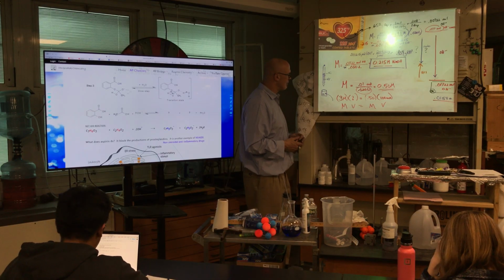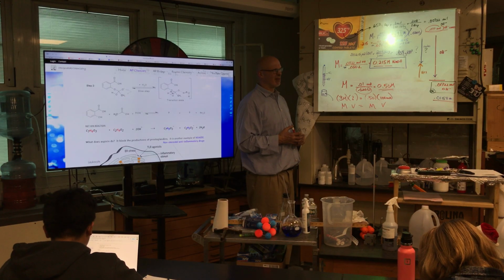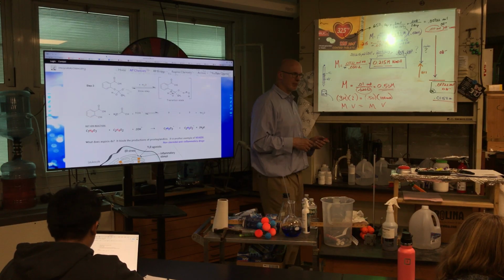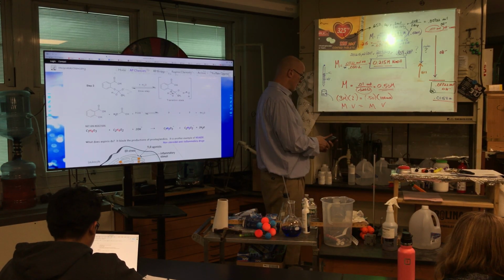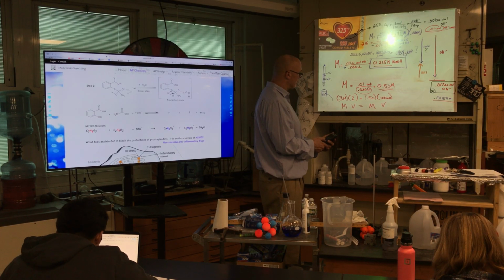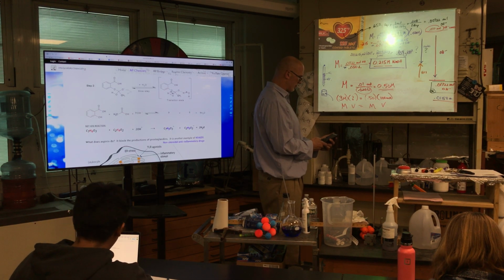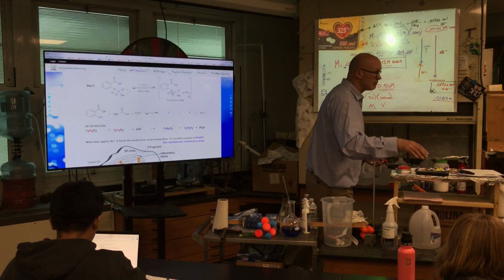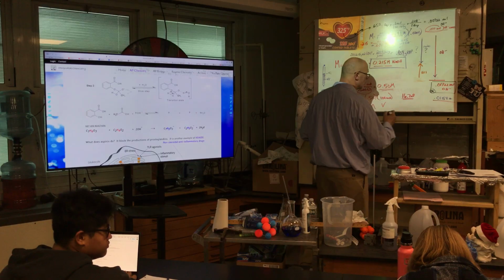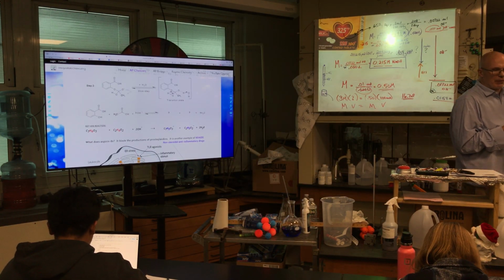0.5 times 100 is 50. 50 divided by 3 is 12 point, no. So what we got? What's that value? Okay, I'll do it. I'll get it wrong on the video, people will slam me. 0.5 times 100 divided by 3. 16.7. What does that mean, party people? I'm gonna measure out 16.7. I'm gonna put that carefully into a volumetric flask.